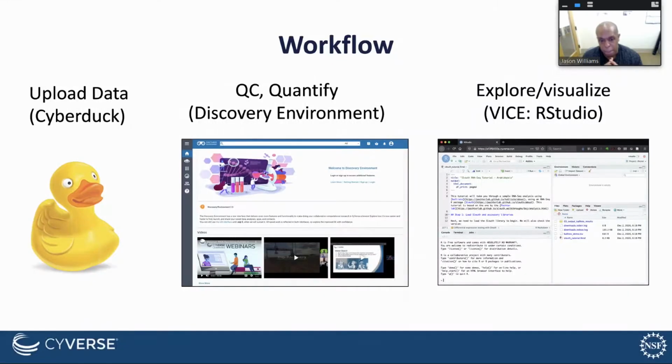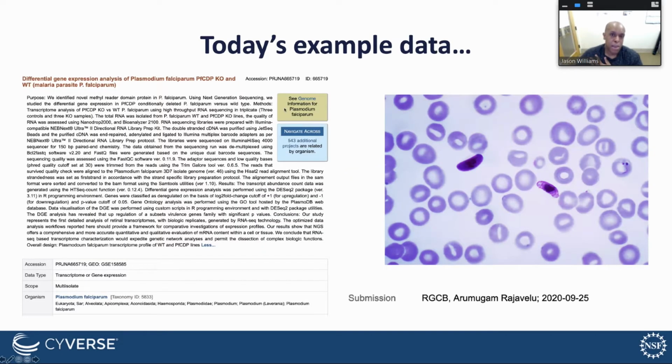The second thing is there's really only a couple applications, one if you're lucky, really two if you're going to use Sleuth, that you're going to use in the discovery environment, this is the Cyverse platform, in order to do the analysis. Now, these tools are built at the command line, but the discovery environment is a point-and-click interface. So even if you don't know command line, you can go ahead and use these tools. And then the very final thing is we're going to analyze the data and visualize it in Sleuth.